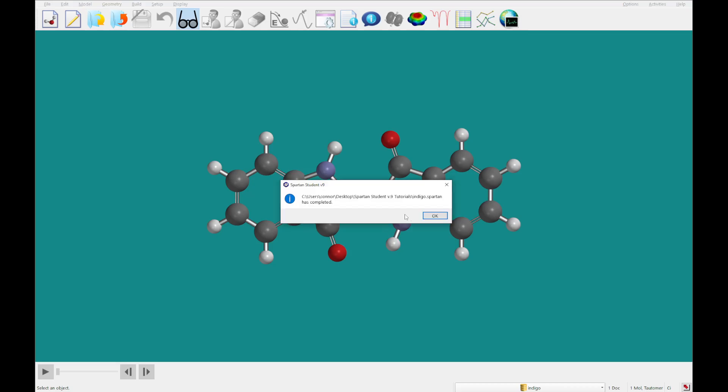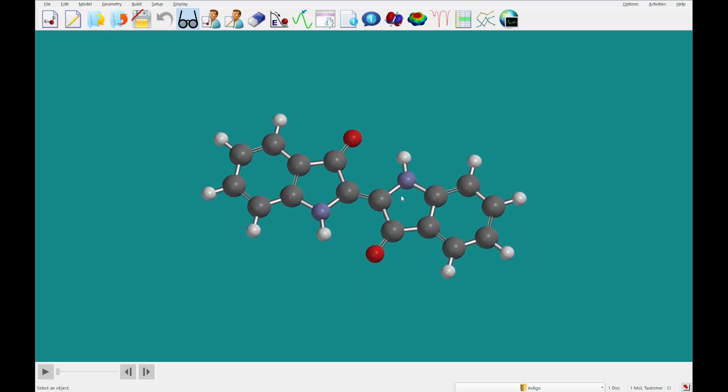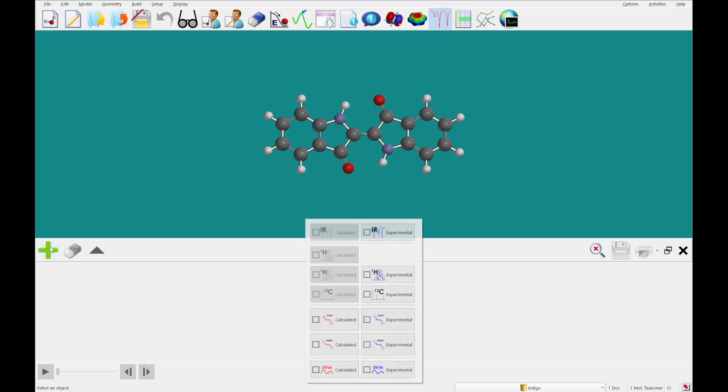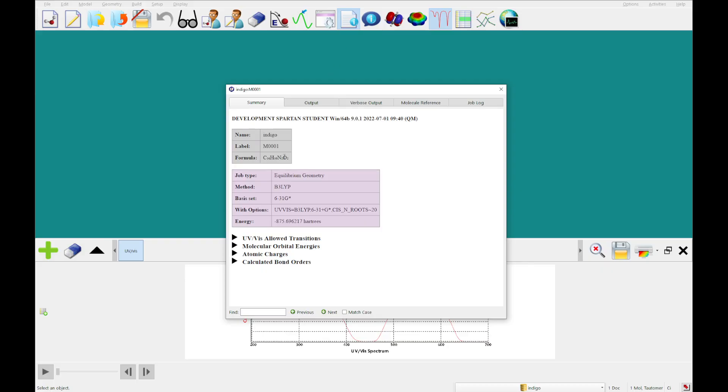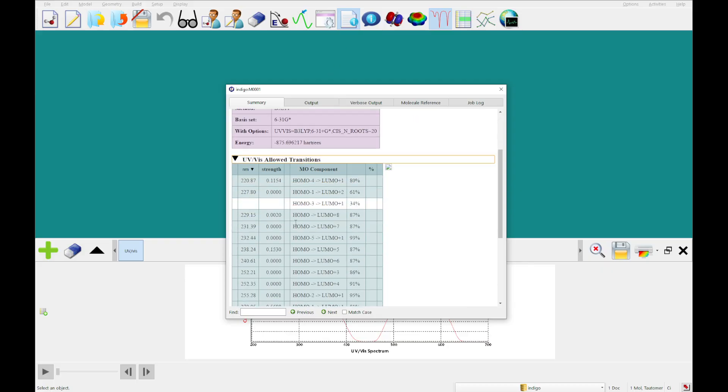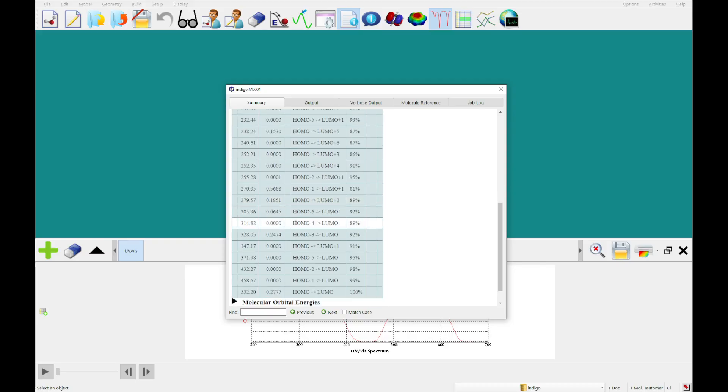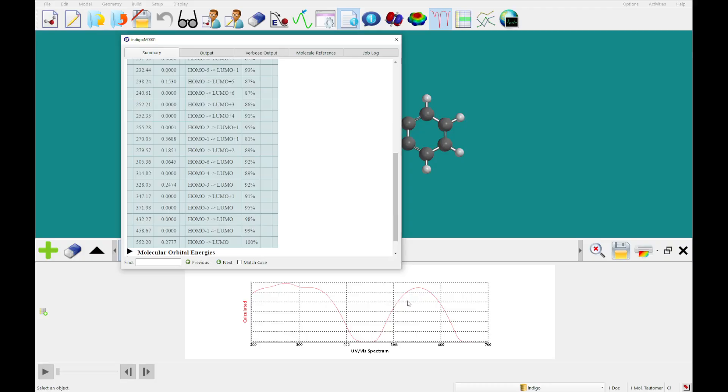Alright, so now that that calculation has completed, what we're going to do here is take a look at the calculated UV spectrum. And you can compare that with calculated, or you can get at this information here. And as you can see here, it looks like the max happens somewhere here, between 500 and 600, and that corresponds with this.